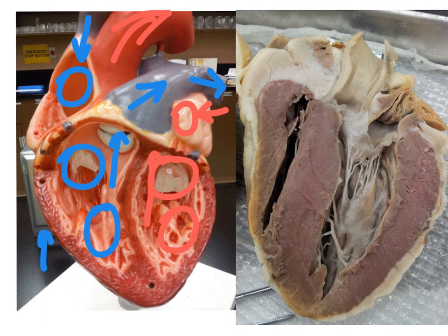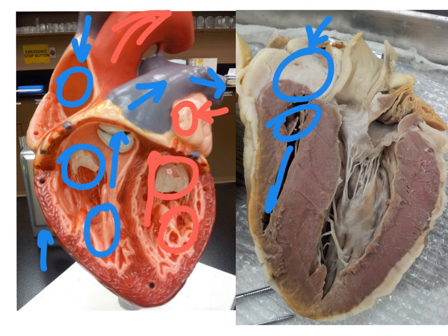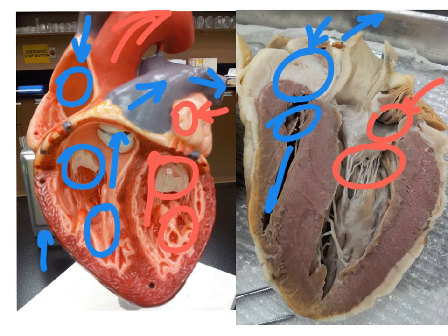On the sheep heart: the vena cava coming into the right atrium going through the tricuspid valve into the right ventricle and then up and out the pulmonary trunk going to the lungs. Oxygenated blood returning via the pulmonary veins into the left atrium, through the bicuspid or mitral valve into the left ventricle, and then going up through the aortic semilunar valve out the aorta.